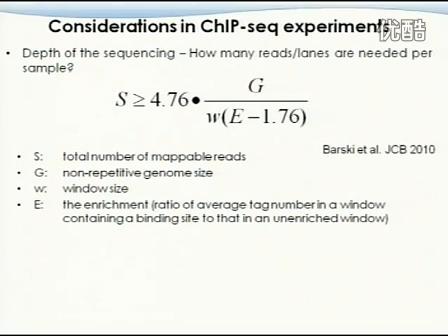This is the same author, the same group from the 2007 Cell paper regarding the histone mapping by ChIP-seq, 20 histone markers, that study. So they have a lot of experience. That's from Keji Zhao's group from NIH. So let's look at this equation in a little bit of detail. I'm not going to tell you how they derived this. That is a little bit more complicated.